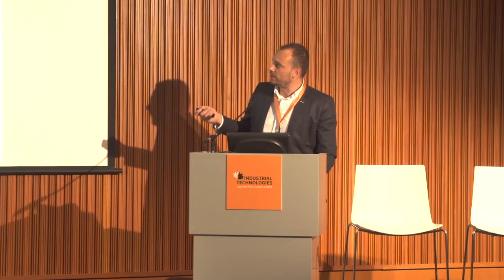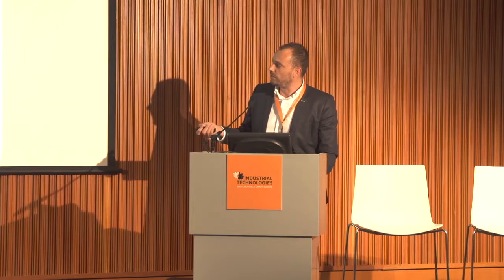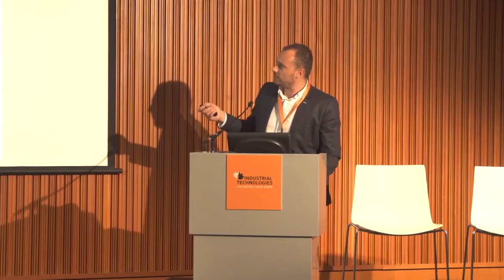First of all, let's take a look inside the bioreactor to get a feeling for how this device looks. A bioreactor consists of a vessel, and in the middle is the impeller, which is rotating and providing good mixing. We have the sparger at the bottom, where we put fresh air into the system because the bacteria need oxygen to grow, for example. That's exactly how our model looks on the right side.